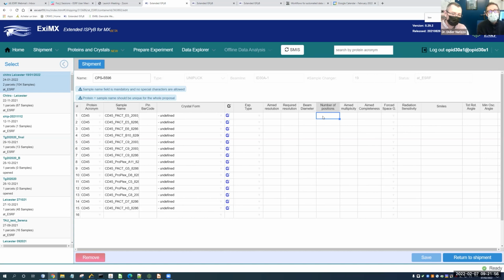Don't put 10 because you say, well, I might have some microcrystals here, and I will be able to find something as good as I can find. Okay, so voila. That being said, any crystals that are below 10% of the best crystal are cut out. You may have 10 crystals in there, but if only 3 of them diffract to a decent resolution, we only collect on 3.